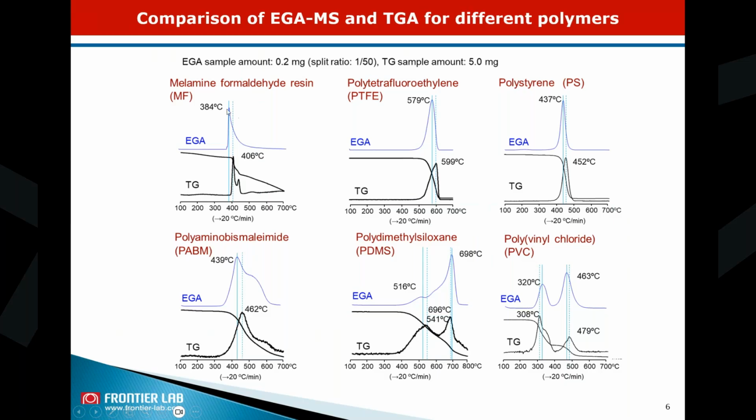Okay, so you can compare the different polymers shown here, like the melamine formaldehyde resin, PTFE, polystyrene, and also this polyaminobismaleimide, then polydimethylsiloxane, and polyvinyl chloride.